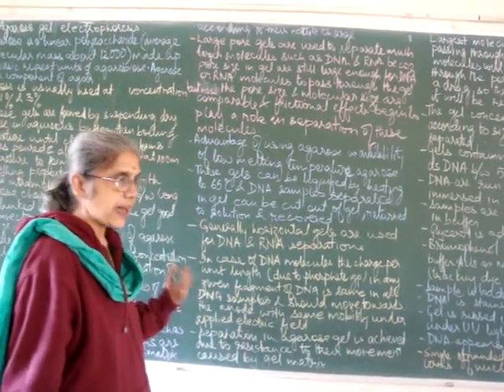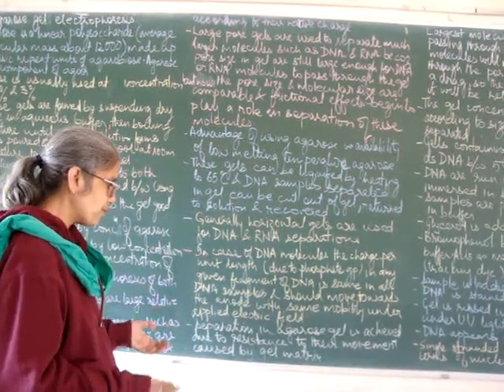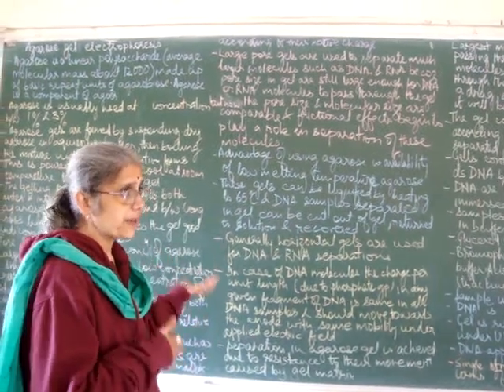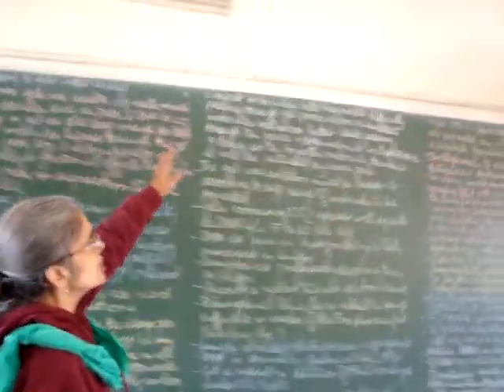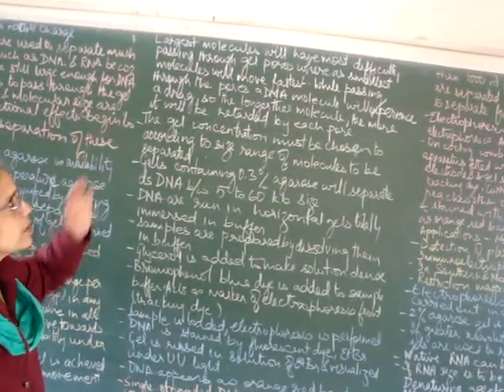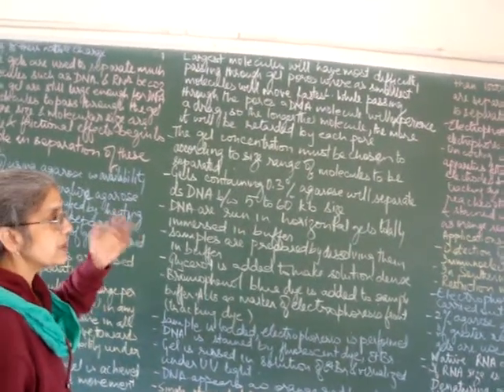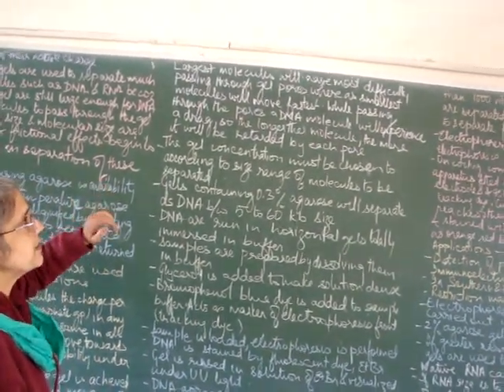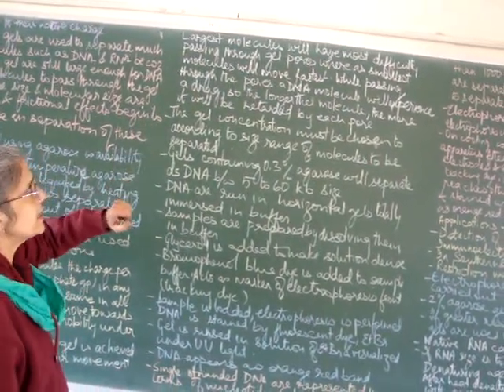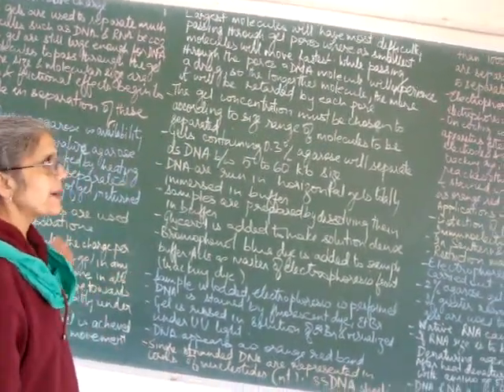So separation in agarose gel is achieved due to the resistance of the gel matrix to their movement, because the pore size is comparable to the DNA size. The largest molecules will have the most difficulty in moving through the gel pores, whereas the smallest molecules will move fastest, resulting in separation of DNA molecules of different sizes. While passing through the pores, a DNA molecule will experience a drag. So the longer the molecule, the more it will be retarded by each pore.